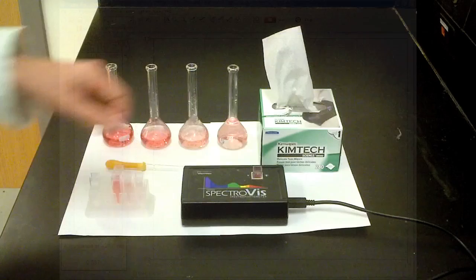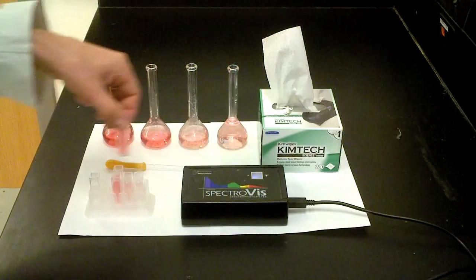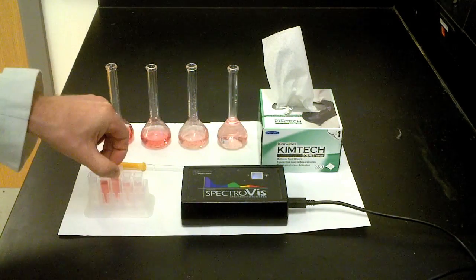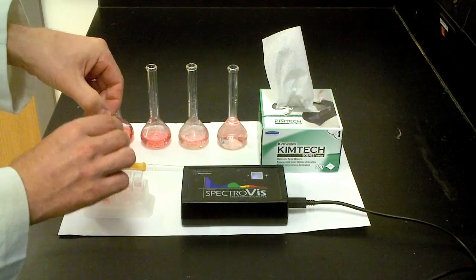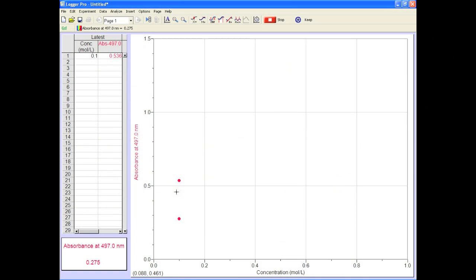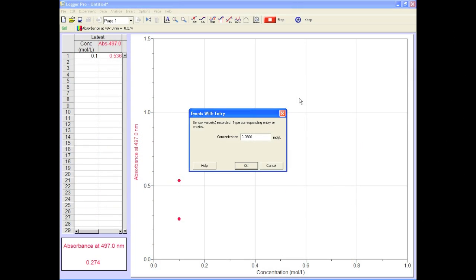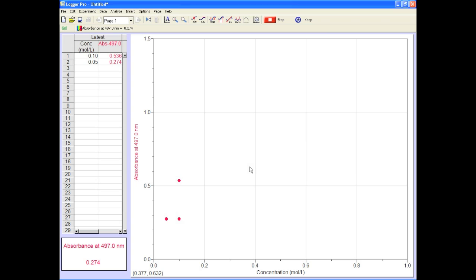Don't press Stop, you're not done yet. Now remove that standard and replace it with the next one in line. Make sure to wipe it down before putting it in the spec. Press Keep and enter the concentration. Check it out, it should be lower in absorbance than your last sample. Excellent.